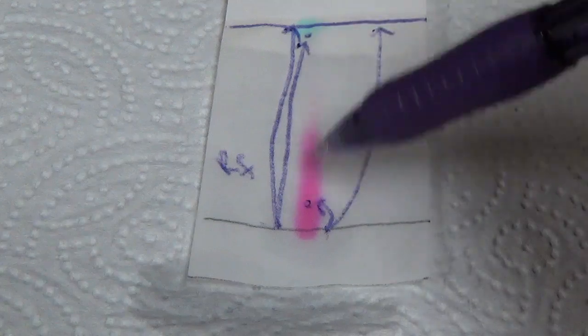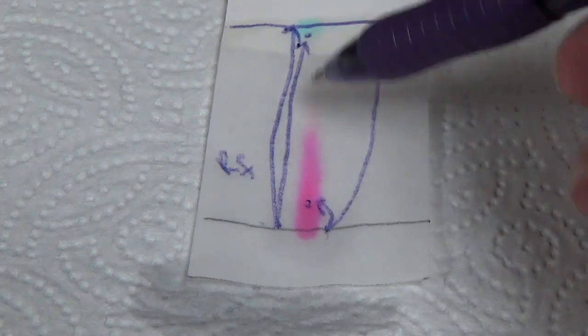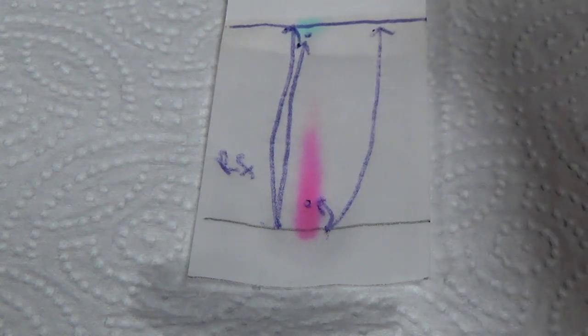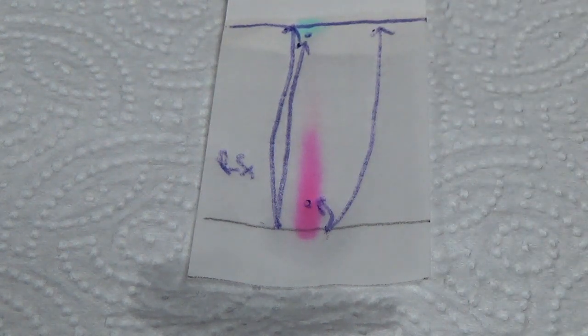And so we could do this for almost anything that's a mixture of things that we have a movable phase and a stationary phase for. There's lots and lots of types of chromatography. Each one uses a different stationary and different mobile phase because of the type of molecules you're separating. Now before we end, I want to show you this one other thing.